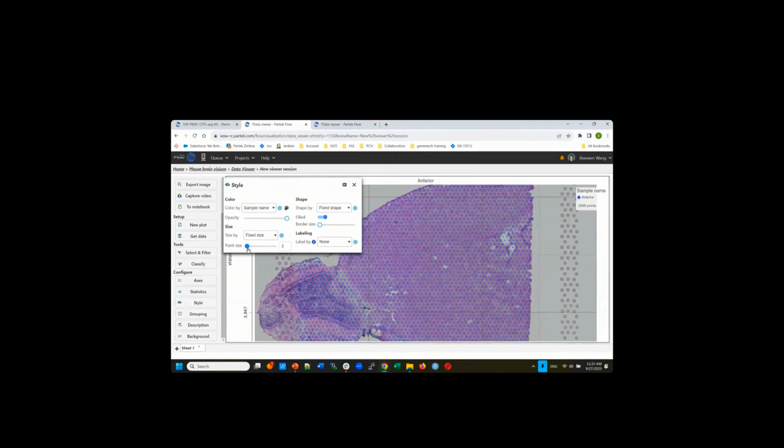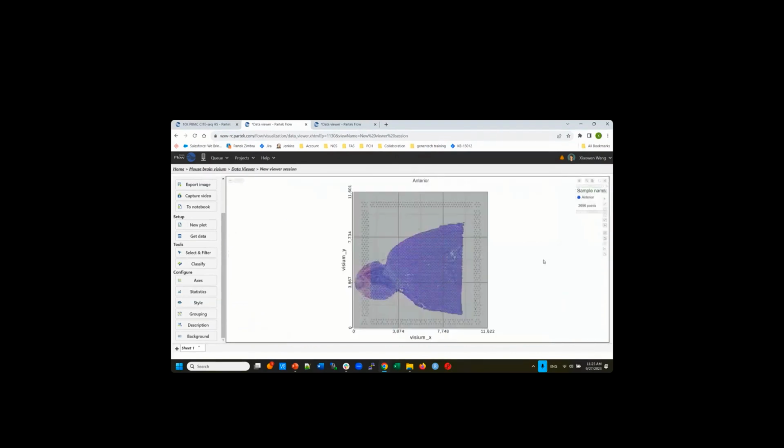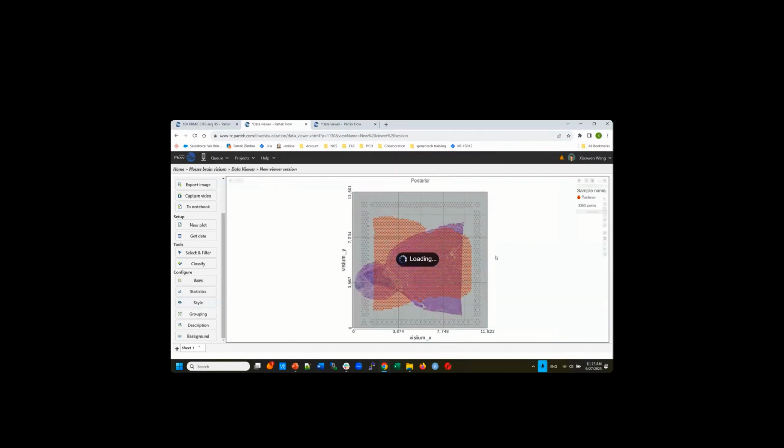And you're going to use the same technology we have. For example, just to quickly show you, this is sample 1. Because of the slides, you can only look at one sample at a time. Sorry, it's under axis. You go to sample 2. This is a mouse brain tissue, posterior and anterior tissue.